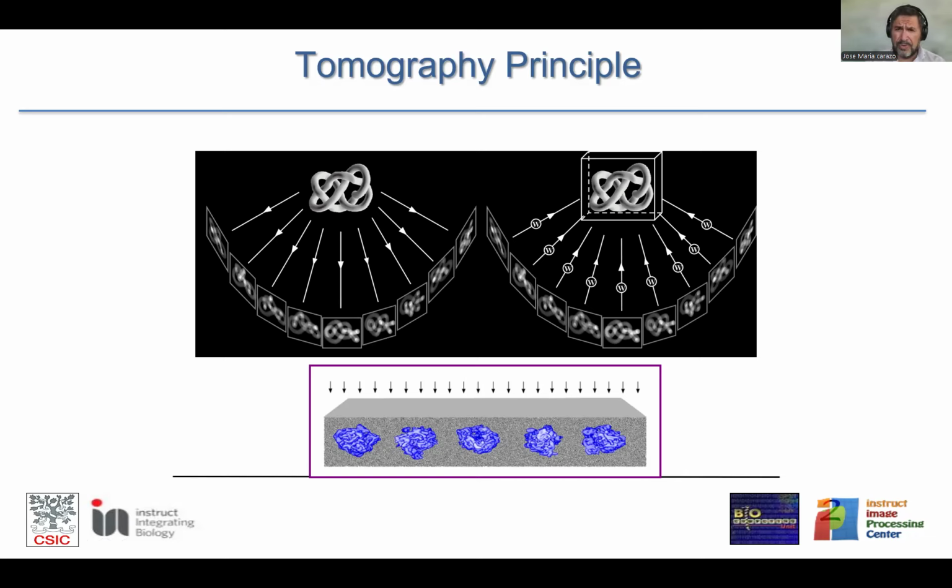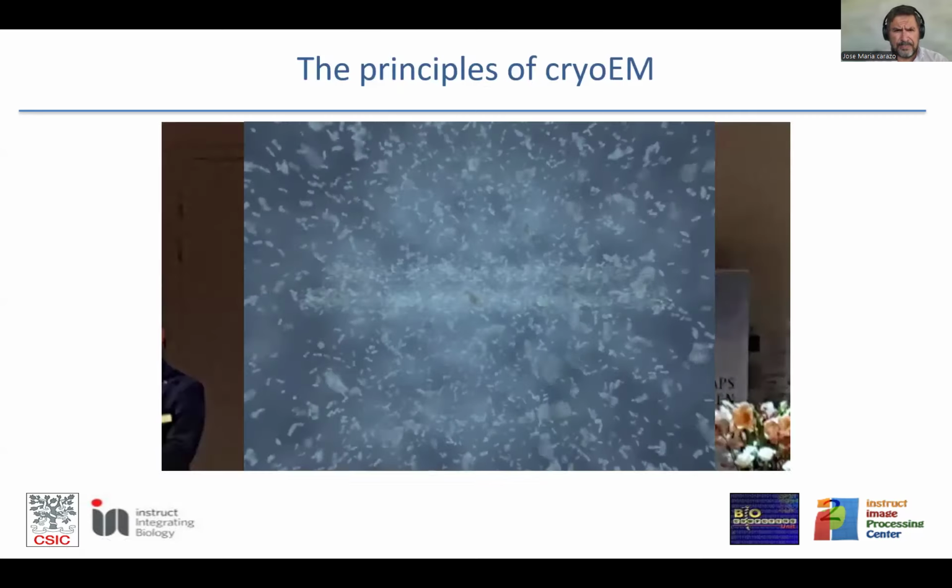Okay, so because this is the time that it takes to freeze, you cannot go faster by this technology. There are other technologies around. You could go to the microseconds, but in very special cases. When you hear time in the context of electron microscopy, you should translate it into milliseconds.